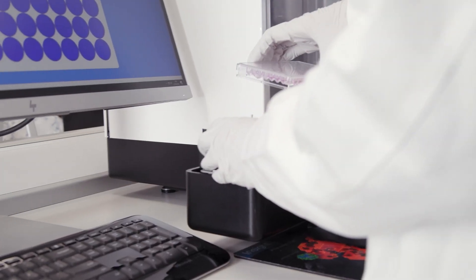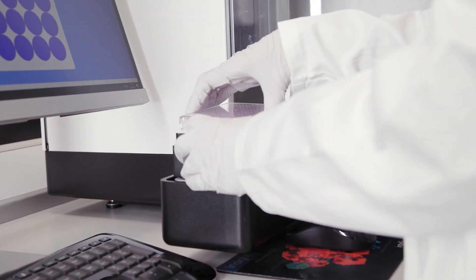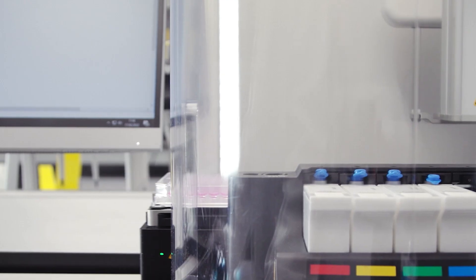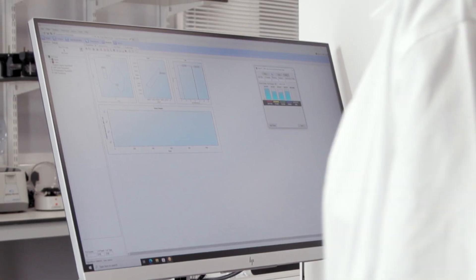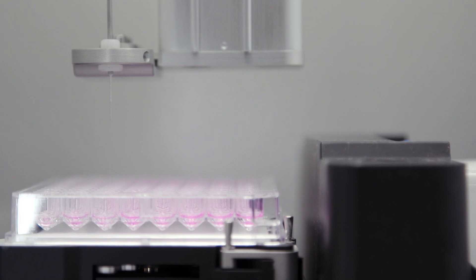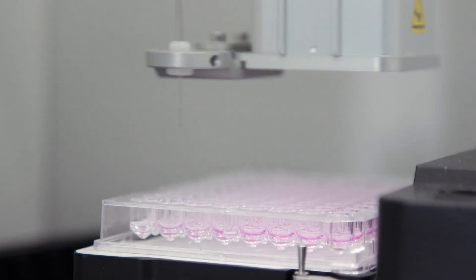Simply place your microplate on the sample shaker, begin the program, and walk away. Micro-volume sampling offers extremely rapid processing, allowing an entire 96-well plate to be processed in under five minutes.